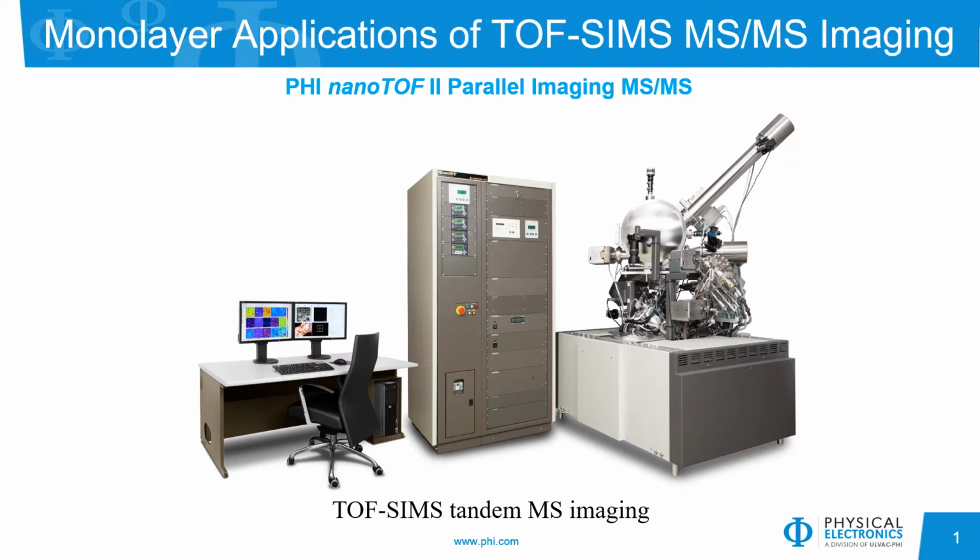Today I'm going to talk to you about some new developments in TOF-SIMS, specifically related to TOF-SIMS tandem MS imaging with applications to monolayer characterization.